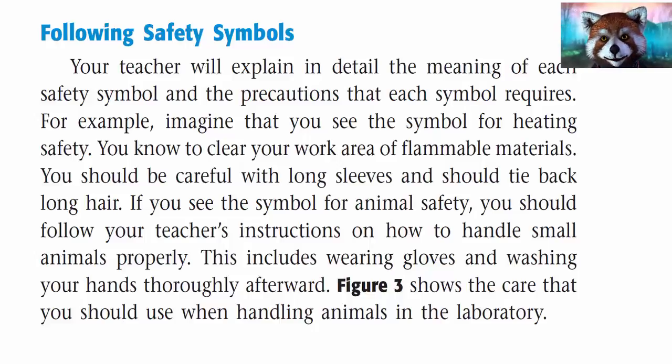If you see the symbol for animal safety, you should follow your teacher's instructions on how to handle small animals properly. This includes wearing gloves and washing your hands thoroughly afterward. Figure 3 shows the care that you should use when handling animals in the laboratory.